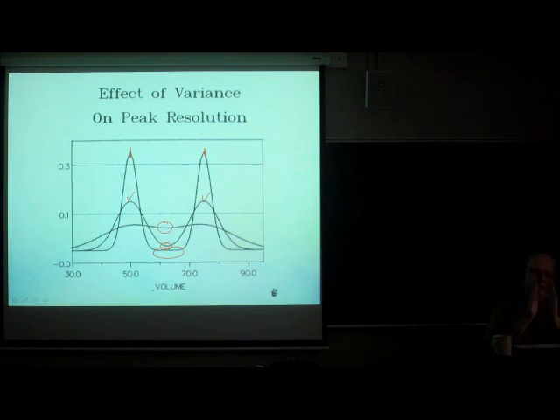Okay, so considering the previous slide and this slide, what are the factors that influence the resolution of two peaks? Peak width? Yes, the individual peak width influences the resolution.